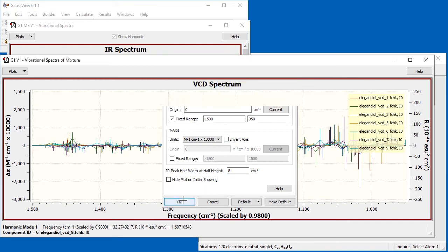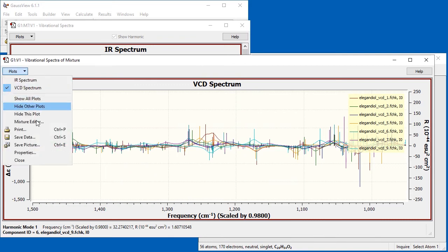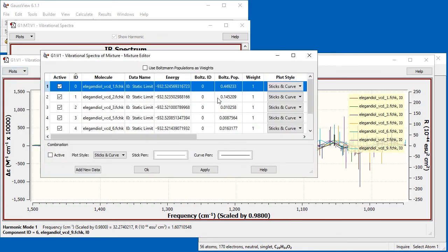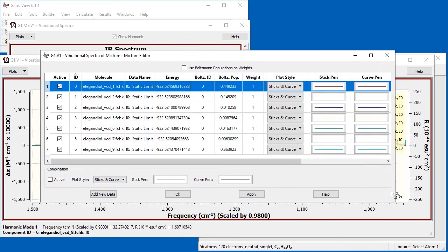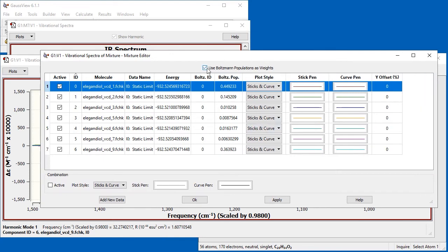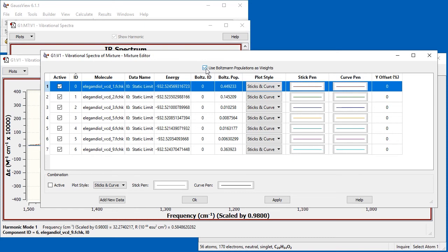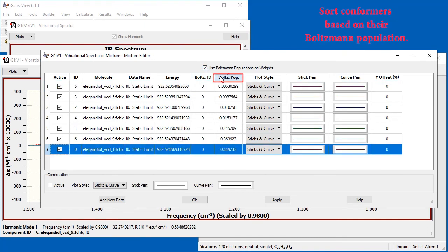Next, we open the Mixture Editor in order to produce the computationally averaged curve. First, we check Use Boltzmann population as weights. This applies weightings based on each conformation's free energy. We can see that the three lowest-energy conformers will dominate the Boltzmann averaged spectrum.